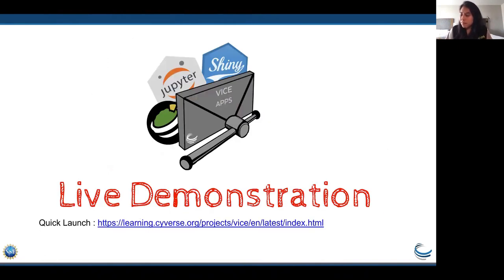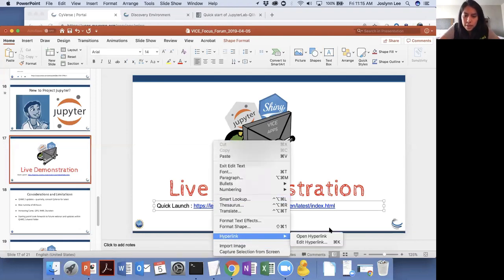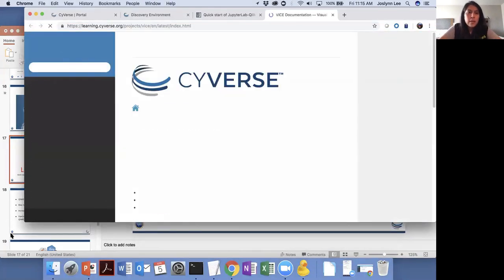So I tried to get through this because I think the more exciting part is showing a live demo. So I'm going to get out of PowerPoint now and then move into showing you a little bit around CyVerse.org so you're familiar with things. So let me exit out. And I'm going to click this link, open. All right.